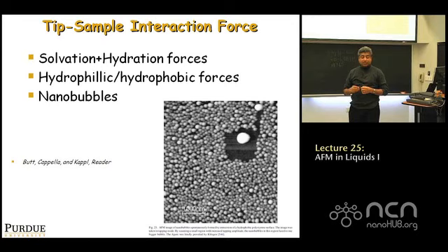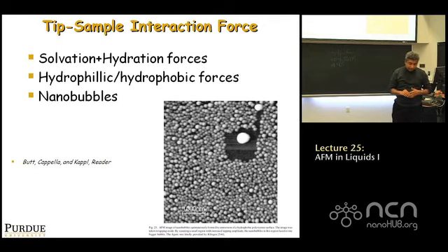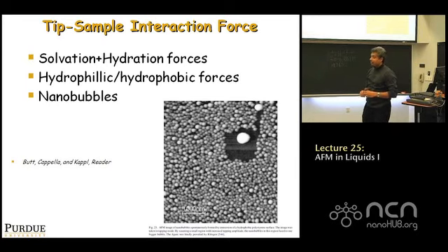That's what we're referring to here. This is not about the electrostatic forces, this is not Van der Waals forces. This is physically what you need to do to push the last few layers of water molecules out so you can make a solid-solid contact. These forces are, I would argue, quite difficult to measure. They are difficult to model even.